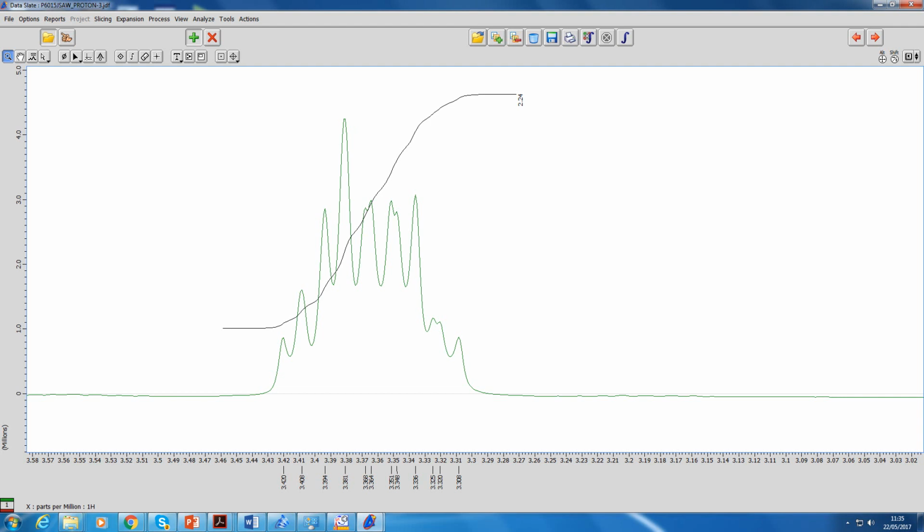Let's zoom, say, from 5 to 0. So 5, if I go just now down by the bottom of the baseline on 5. Yep, just missed it. 5 up to 0. And then 5. Doesn't have to be 5, it's just a convenient point here. 5 to 0. Then the peaks overlap. Well, they don't overlap, but they overlay to some extent. So that might be good enough for what you want to do.